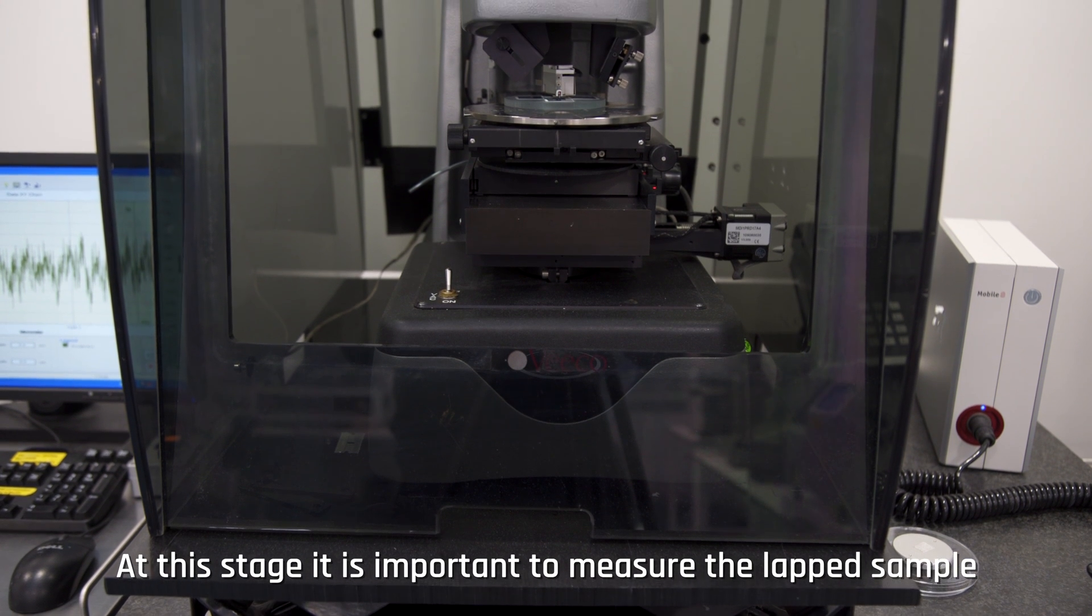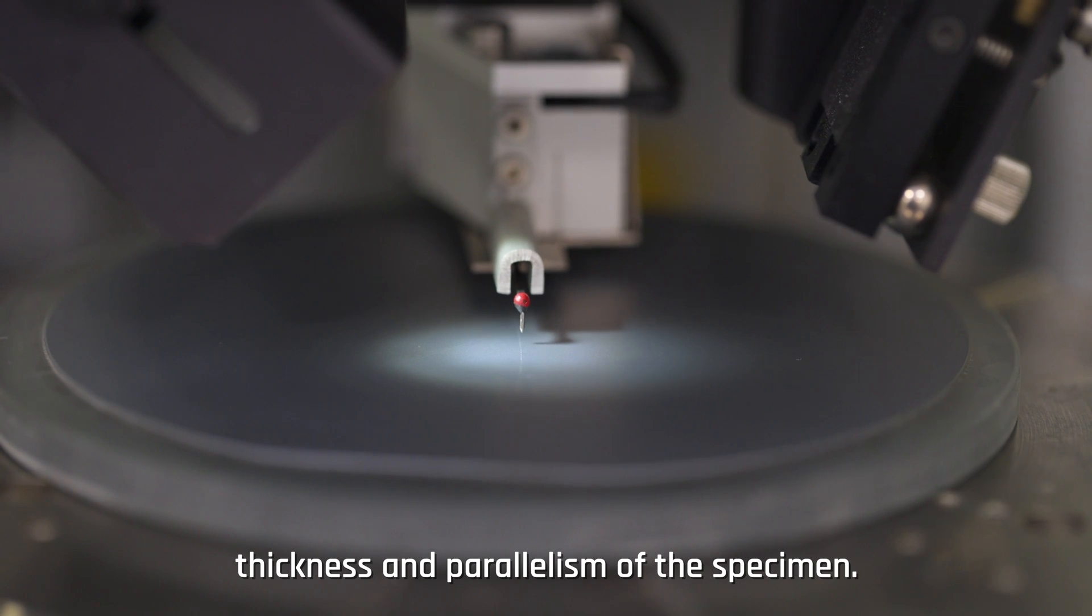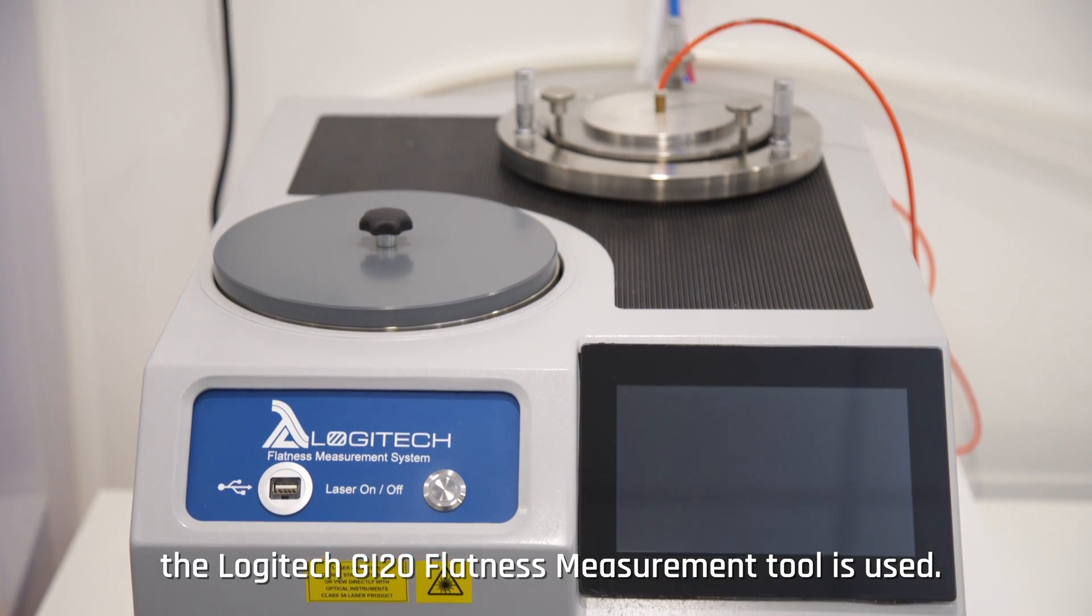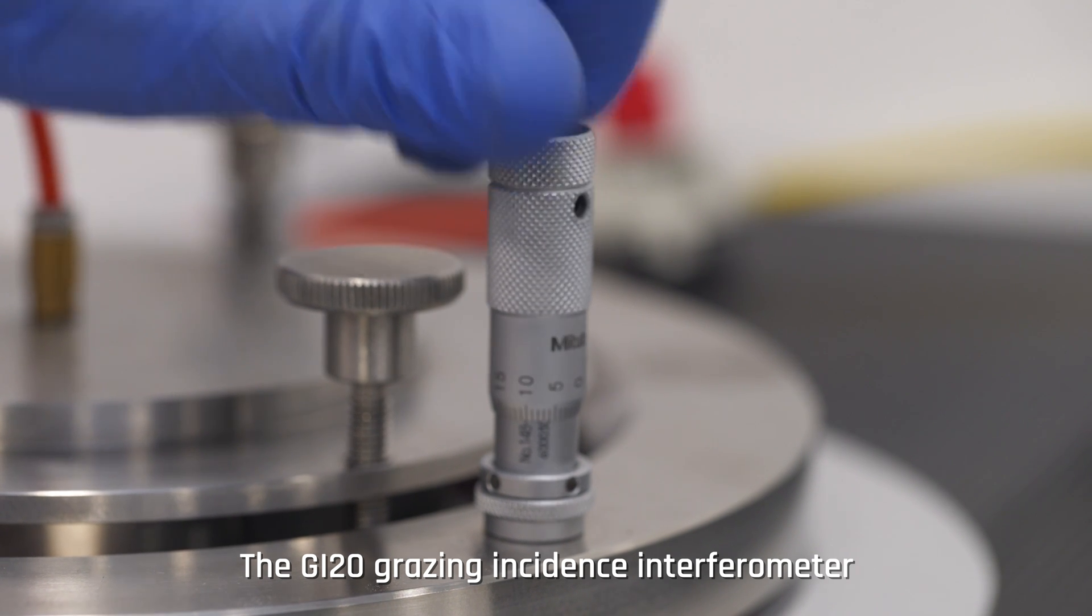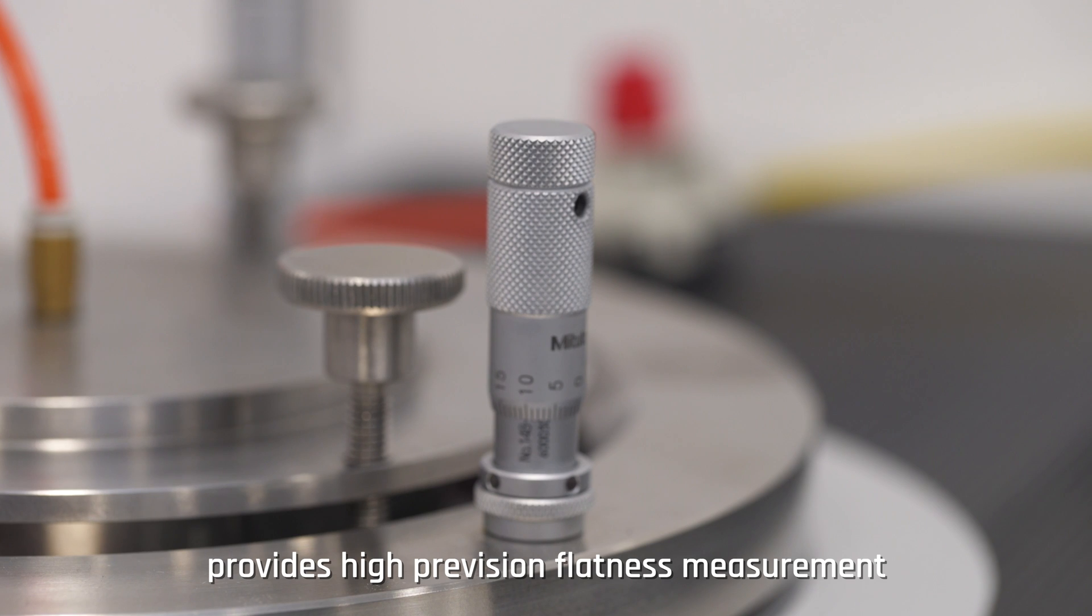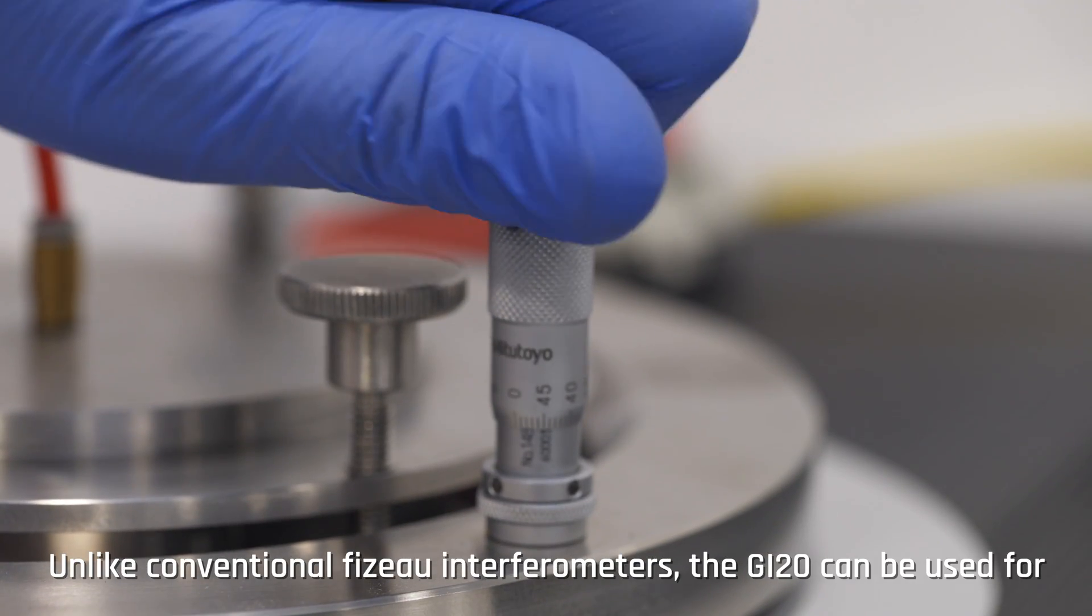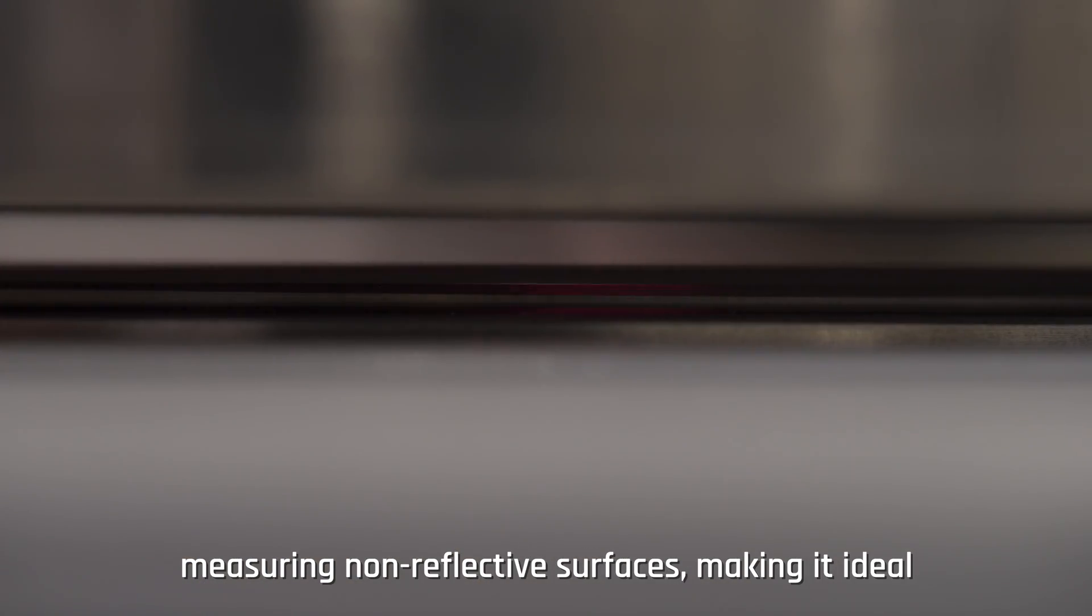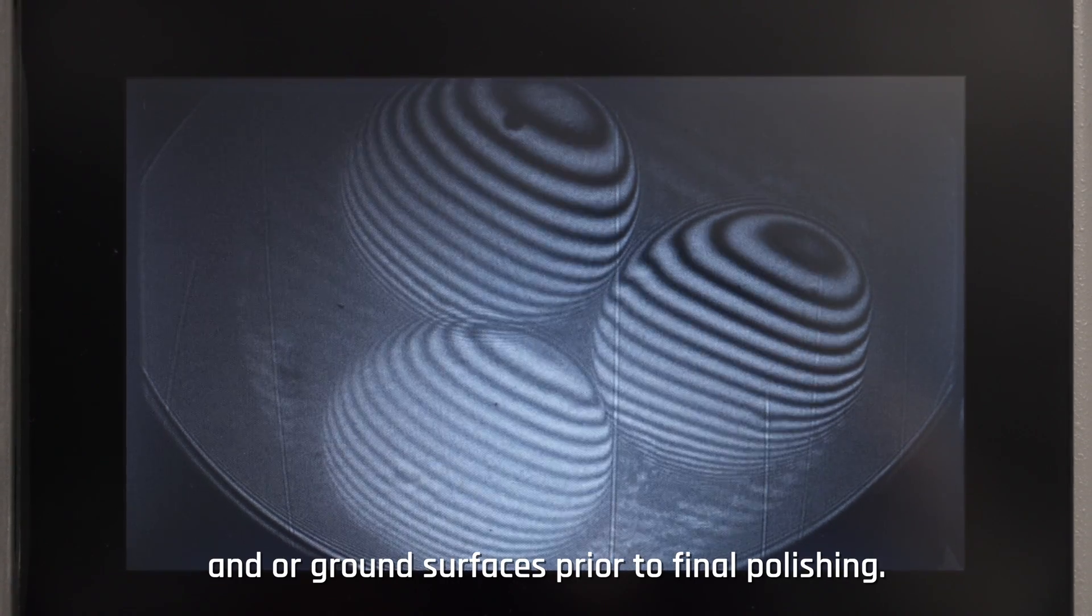At this stage, it is important to measure the lapped sample to gauge the flatness, surface roughness, thickness, and parallelism of the specimen. For measuring the flatness of the sample, the Logitech GI 20 flatness measurement tool is used. The GI 20 grazing incidence interferometer provides high precision flatness measurement suitable for use with lapped and semi-polished surfaces of up to 150 mm. Unlike conventional Fizeau interferometers, the GI 20 can be used for measuring non-reflective surfaces, making it ideal for carrying out checks on lapped and/or ground surfaces prior to final polishing.